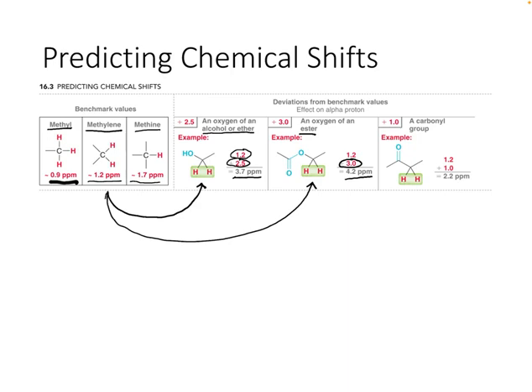And then what if the methylene group is next to a carbonyl group? So that could be on a ketone, for instance, or an aldehyde maybe. We're going to add 1 to our expected value, and that will show up at 2.2 parts per million. So let's look at an example of this just to tie it all together.